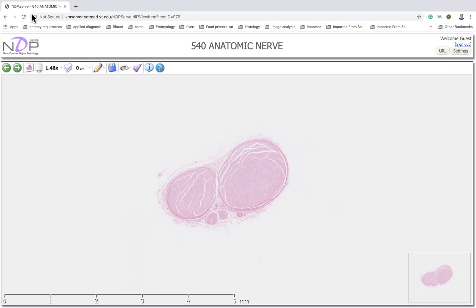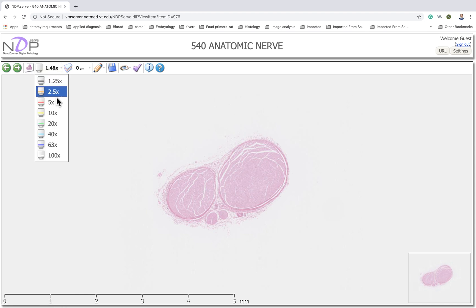In this slide we are going to demonstrate the nerve. As mentioned, the nerve consists of axons, each axon surrounded by Schwann cells. A bundle of nerves surrounded by connective tissue is called the perineurium, and the whole nerve is surrounded by another connective tissue called the epineurium.